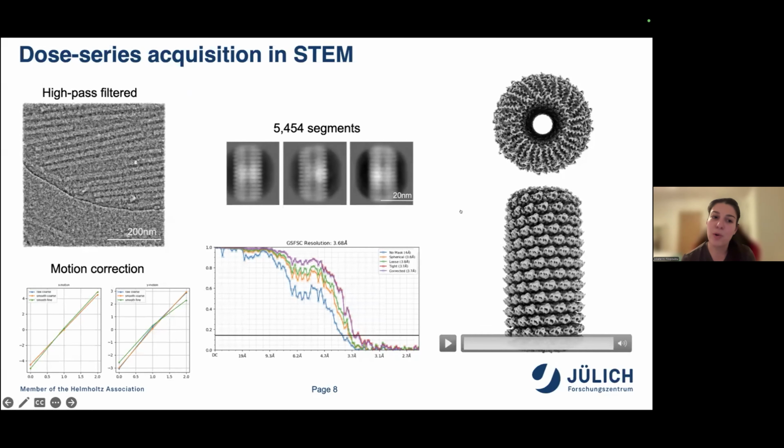It's still work in progress, but we already have the suspicion that as the contrast is better in movie series, it might help the already existing software to align better for the 3D refinements.